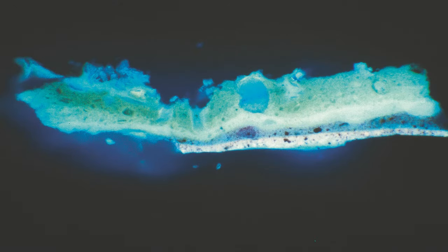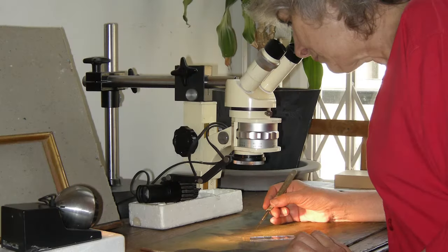The objective of chemically analysing a sample is to identify the different pigments or binders that make up the pictorial layer. It is often in investigating an anachronism that evidence of forgery is uncovered. For example, the presence of a chemical element discovered only in the 19th century would provide conclusive evidence of forgery in a painting that appears, even in its technique, to be of a much earlier period. The physical and microchemical analysis of microsamples allows us to identify the different materials present, as well as the pigments and binders that make up the pictorial layer.